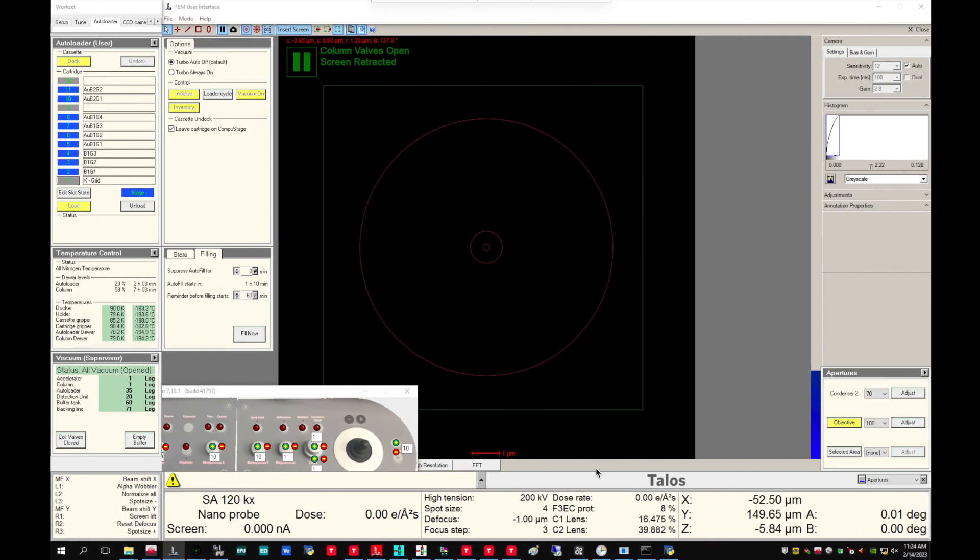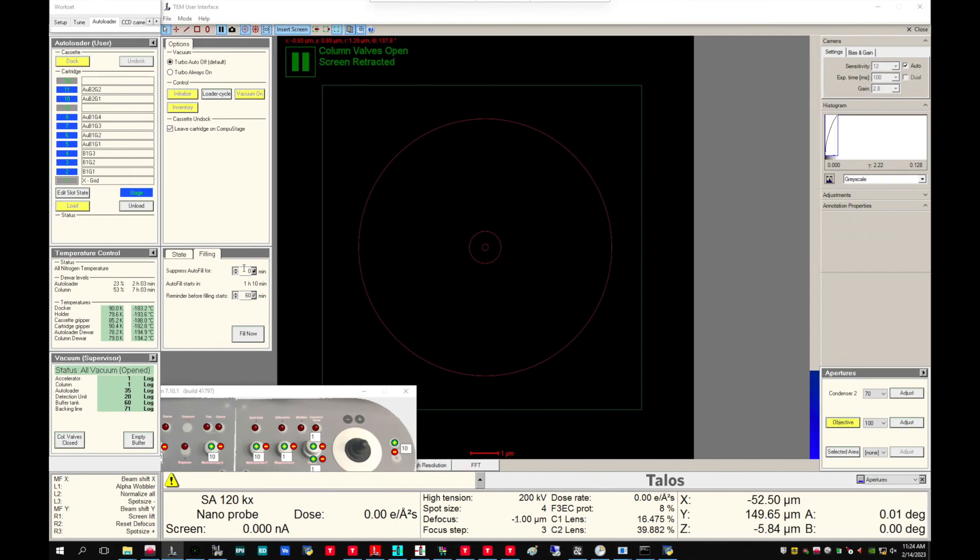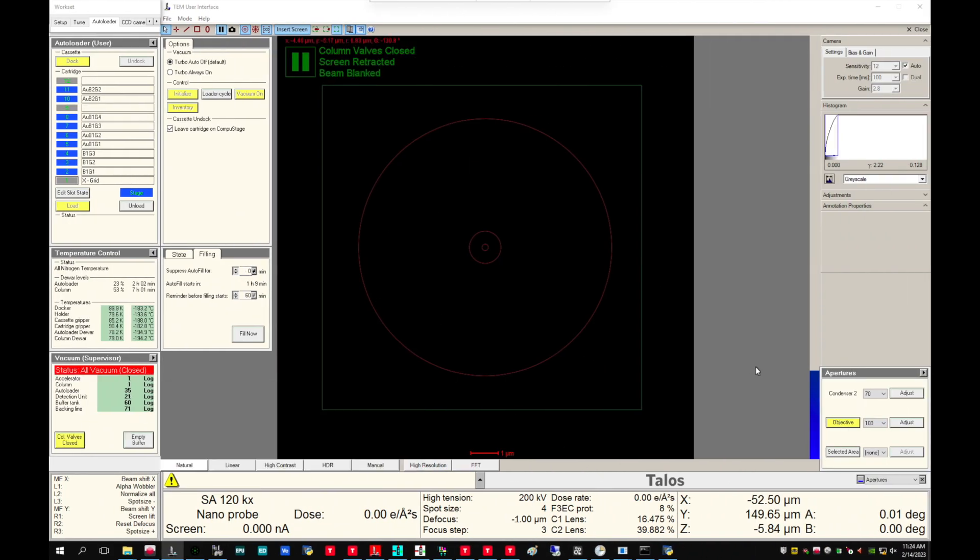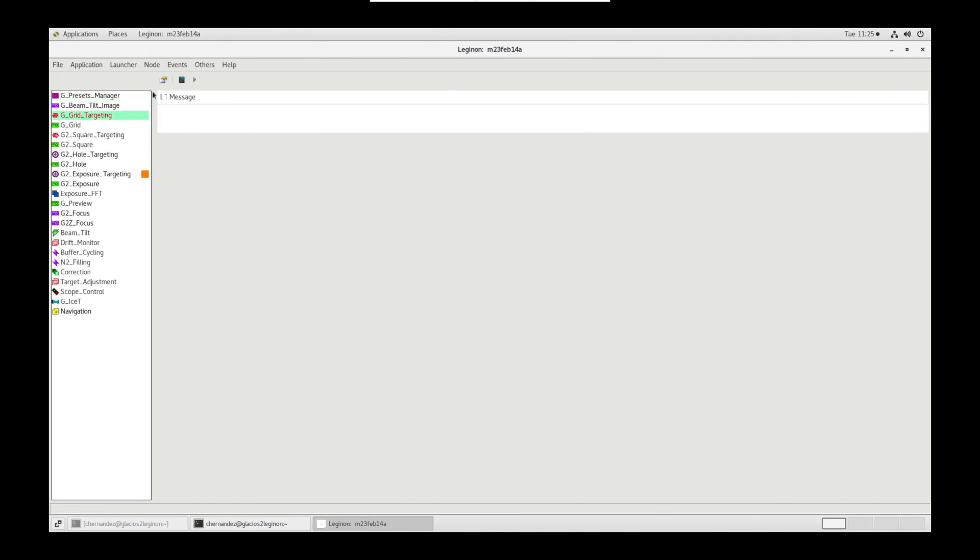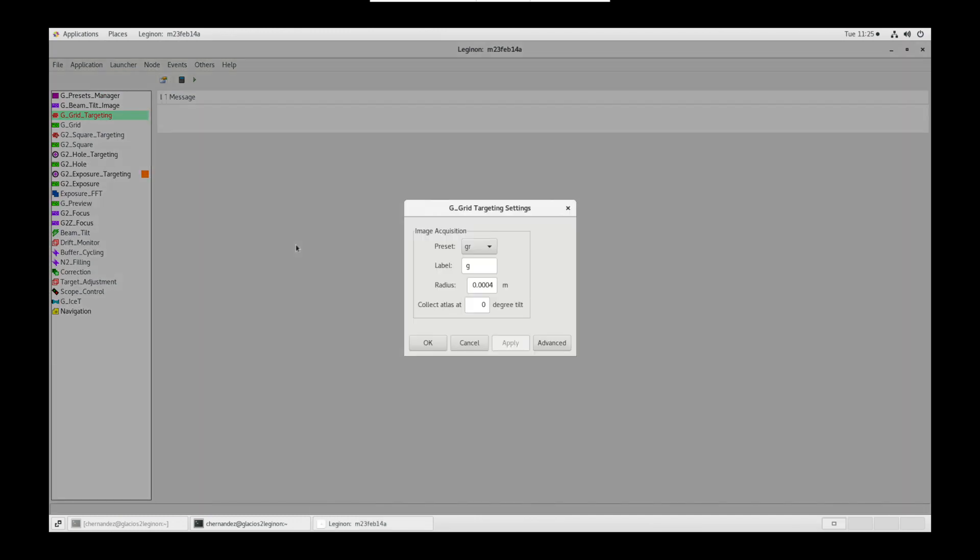On the microscope PC, close column valves. Retract the objective aperture. And select the grid that you would like to use for your template and hit load. In the meantime, let's go to grid targeting node. Click settings. I like to use G for label and 0.007 meters for radius.